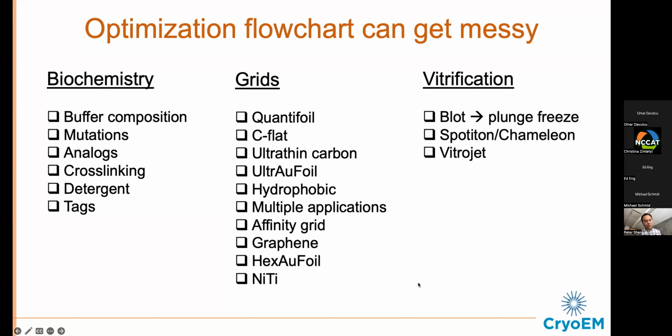Too often, we are reading papers and our expectations are being miscalibrated because we see these examples of beautiful representative micrographs. And so when we see that our own images don't look like that, what are we doing wrong? The reality is that a very small percentage of the data sets that we collect actually end up contributing to a high resolution structure. And more often than not, our images might look something like this. And there currently isn't a great resource where bad images can be used as a learning tool.